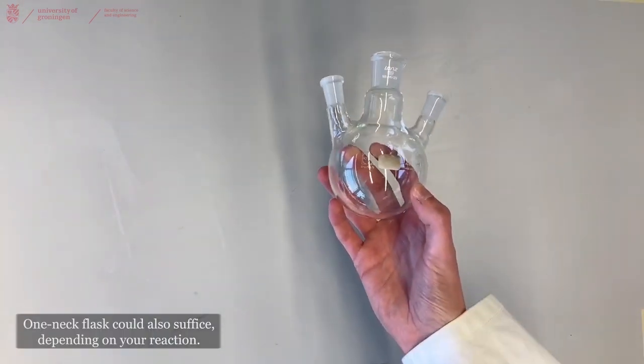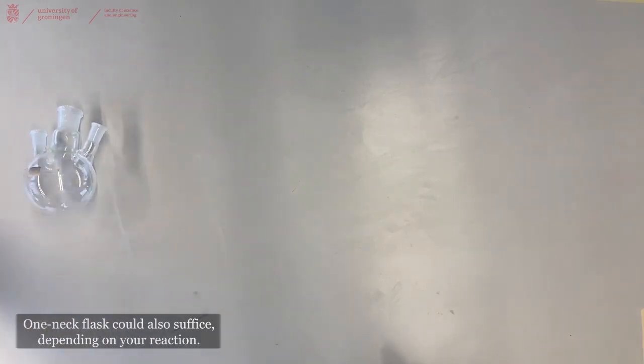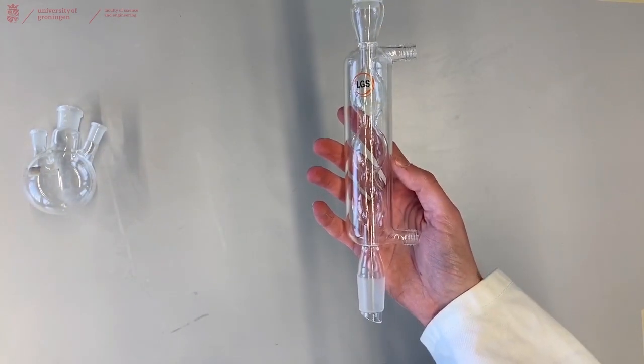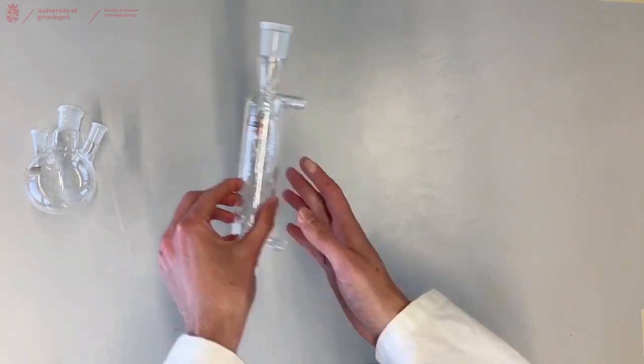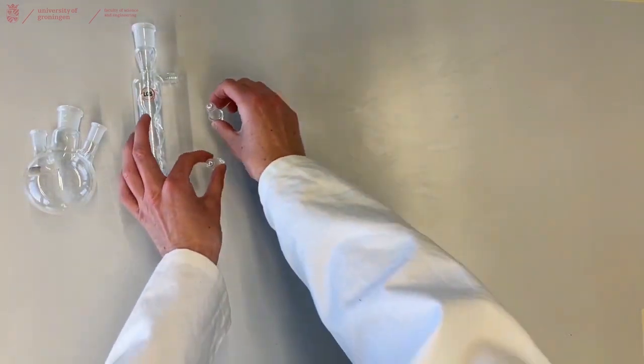You will need one three neck flask for your solution, a bulb condenser to condense your liquid, and two stoppers for the two side necks of your three neck flask.